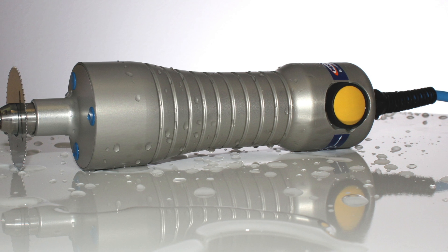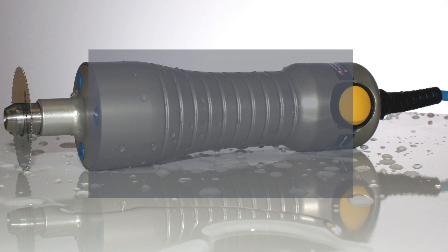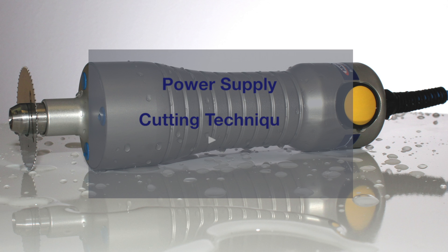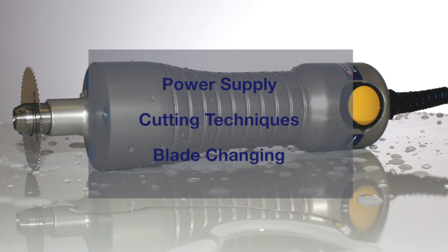This video contains helpful information on the Mopec 5000 Autopsy Saw power supply, proper cutting techniques, and blade changing.